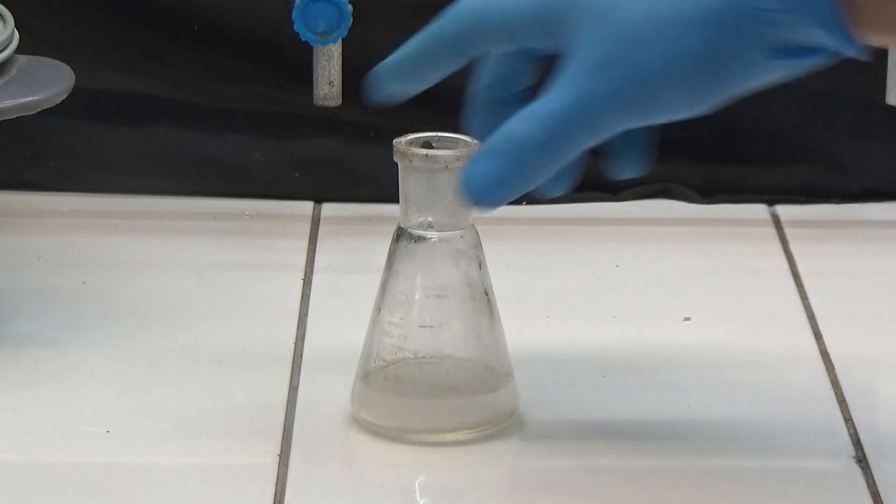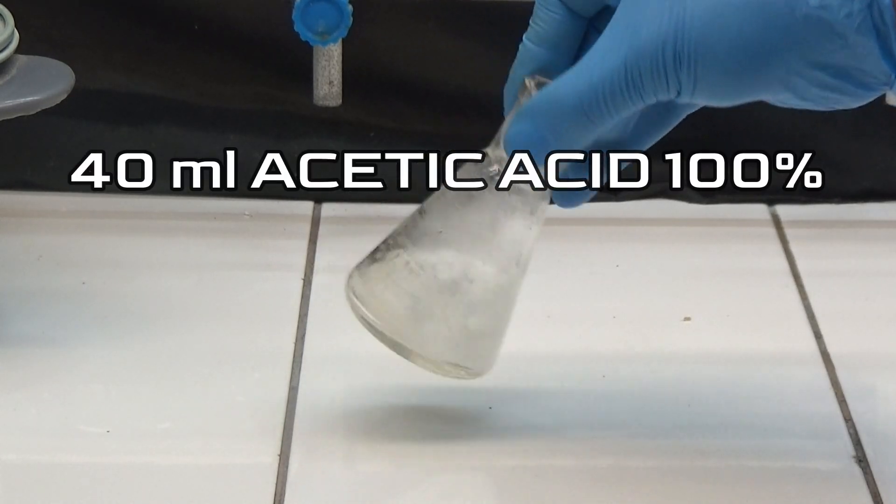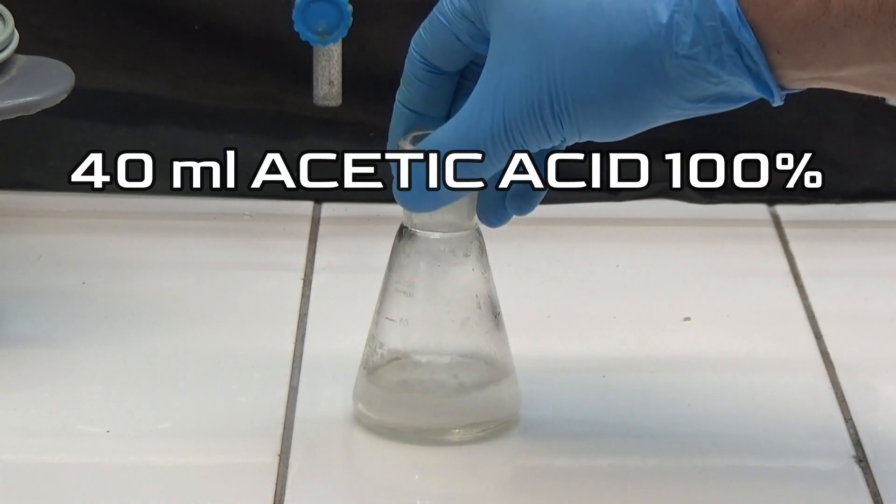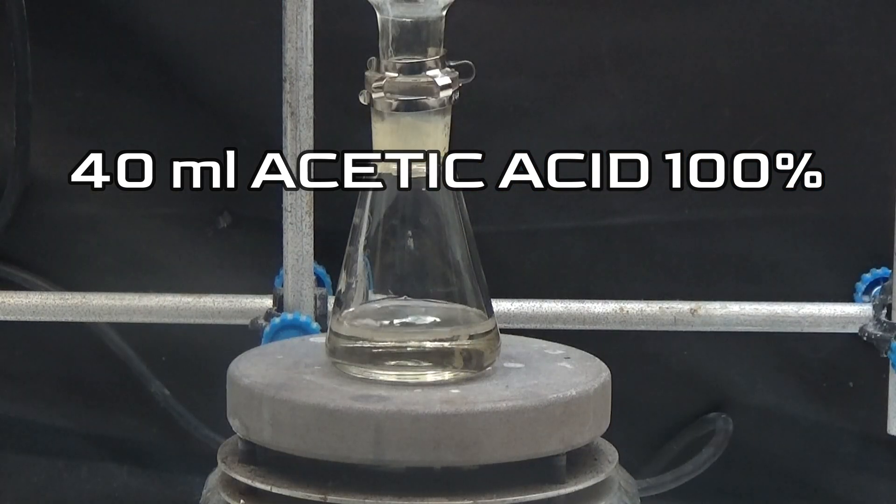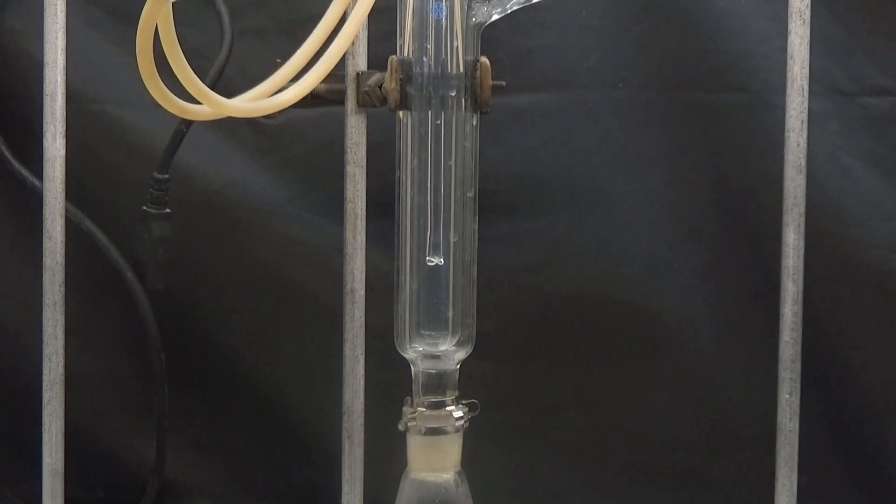To purify the obtained anhydride, we recrystallize it with 100% acetic acid. We put 40 milliliters of 100% acetic acid in the flask and heat it to reflux until the solid is completely diluted.